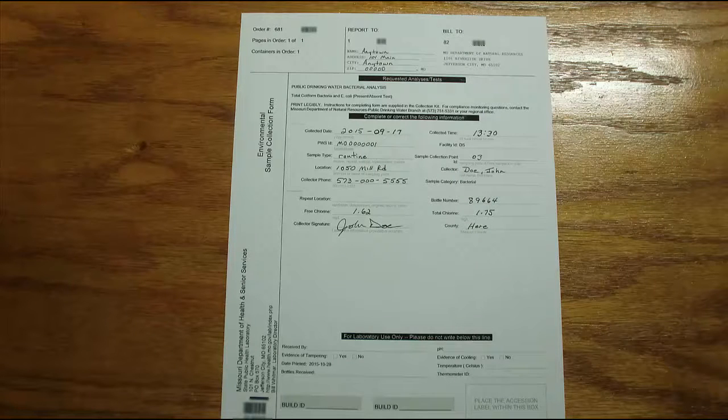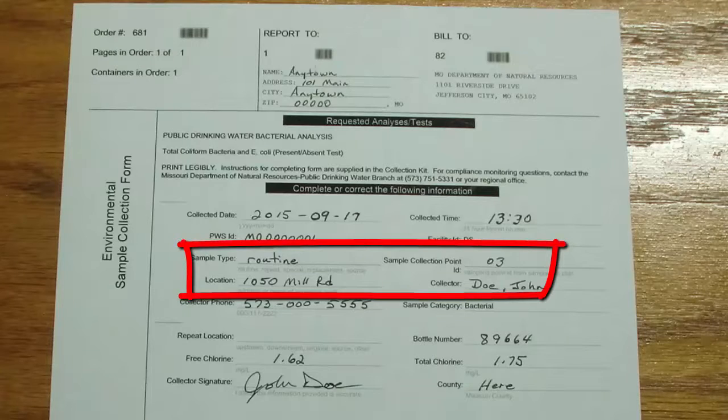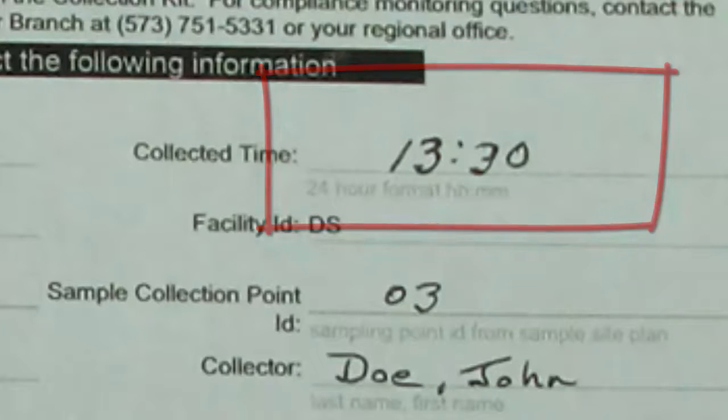Now that you have a BACT sample ready to send to the lab, fill out the top half of the sample sheet that comes with it. The bottom portion is for the department's use. Each sample bottle must have a separate sheet which identifies where the sample was collected and the bottle number the sheet goes with, among other things. Review the instructions that come with each set of bottles for completing the sample sheet. Note that the time of collection must be provided in 24-hour or military time — if you collect your sample at 1:30 PM, for instance, you'll write 13:30 on the sheet.